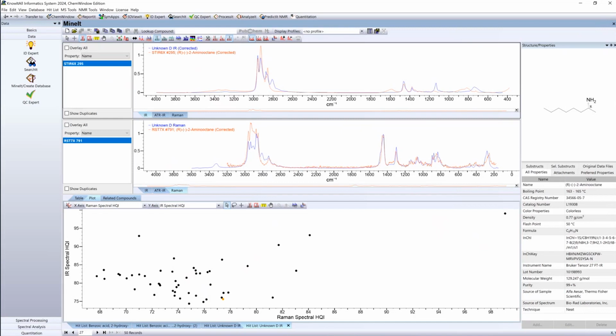And Wiley's library of predicted infrared spectra is an attempt to increase the catalog coverage of Wiley's IR chemical space. This does not mean to increase the chemical space, but to increase the amount of coverage within the bounds of our current library's chemical space.